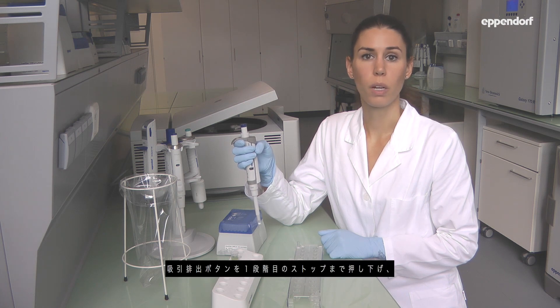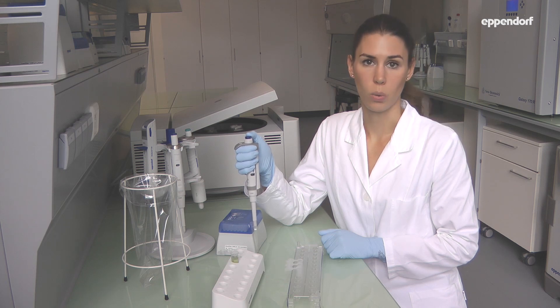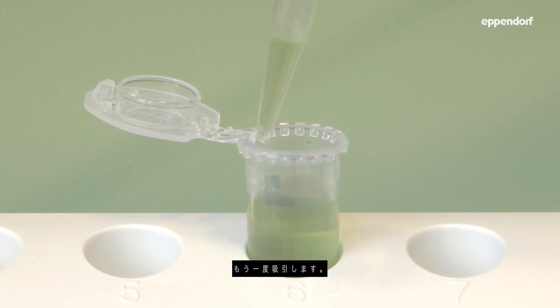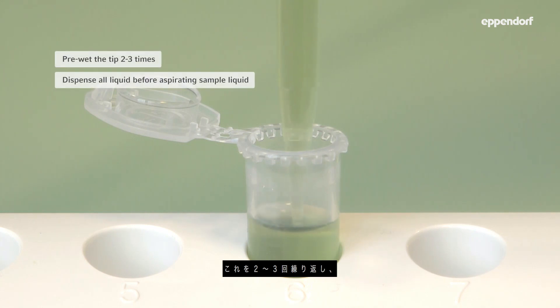Press the control button down to the first stop and immerse the tip into the liquid. Once the aspiration angle and immersion depth have been checked, slowly release the control button. Press the control button down to the first stop again and aspirate once more. Repeat this two to three times to saturate the air in the tip.